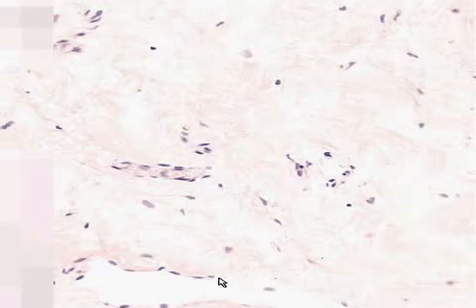So once again, everything pink and fibrillar is probably collagen. The pink stuff, if it's denser, would have a greater density of collagen fibers. They all take up the eosin stain. And of course, in the trichrome stain, there would be green because the cytoplasm of fibroblasts and collagen takes up a green appearance in a trichrome stain. Any spindly cell which looks like it's along a vessel, like a blood vessel here, is probably an endothelial cell.